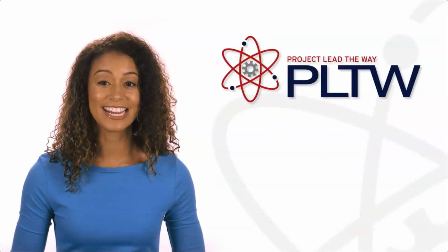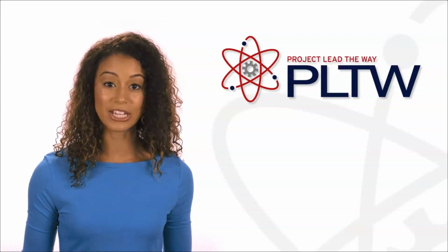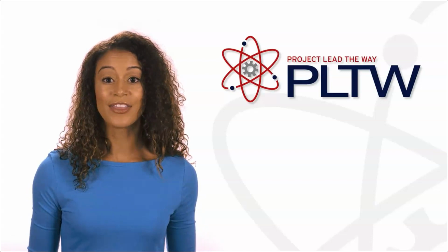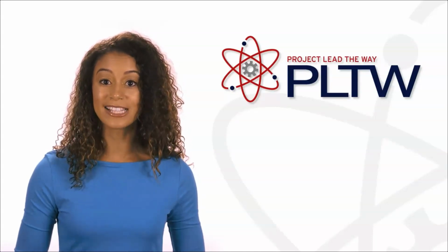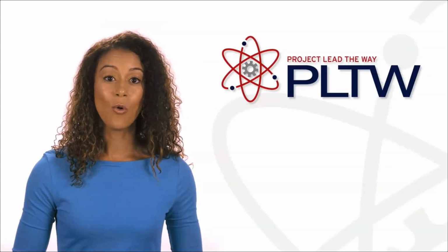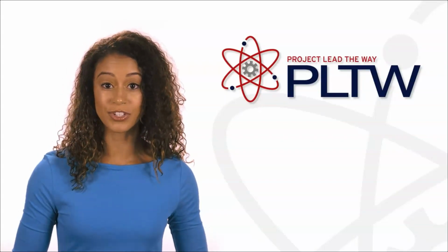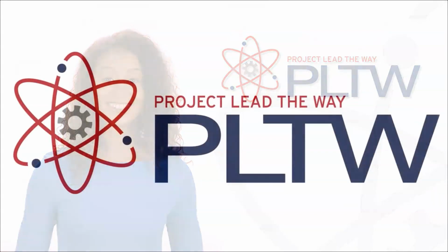Now that you've learned how DNA sequencing works, it's time to sequence the DNA of the pathogen making Sue sick. The sequencing preparation has been done for you, and the sample was run through the sequencer. Now it's your job to analyze the sequence data and determine the exact DNA sequence. Once you have the DNA sequence, you can use bioinformatics tools to identify the specific organism. Good luck!